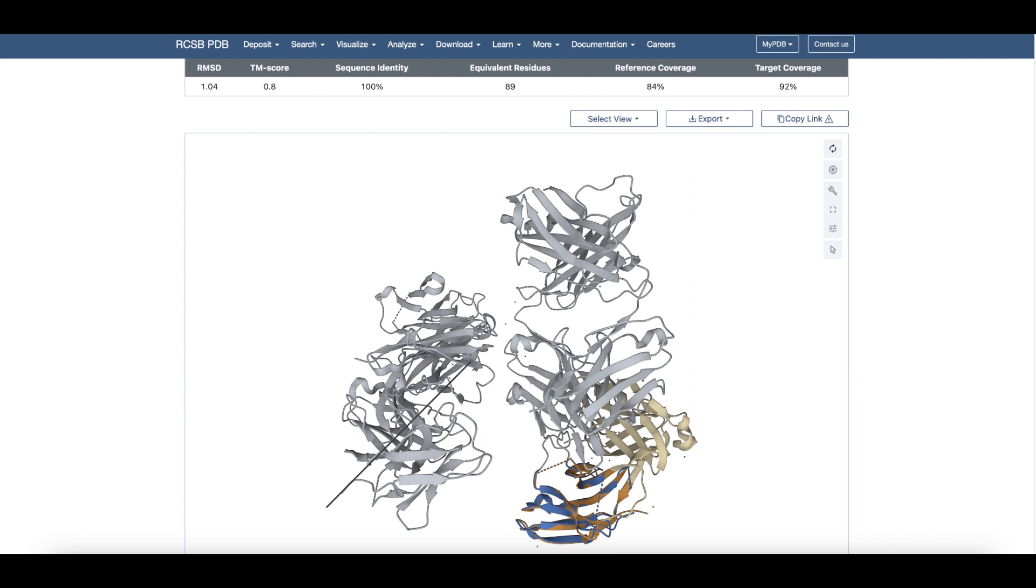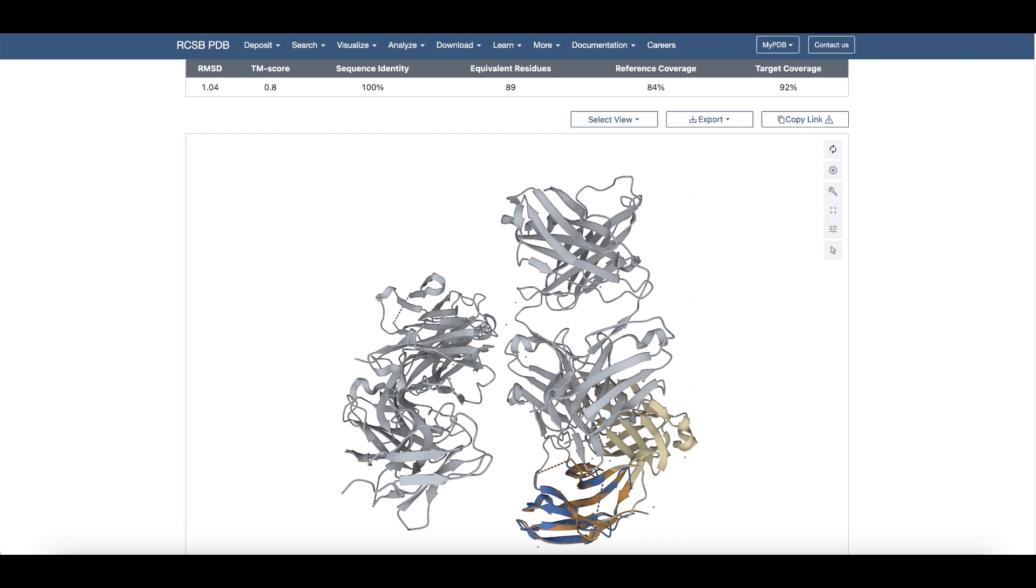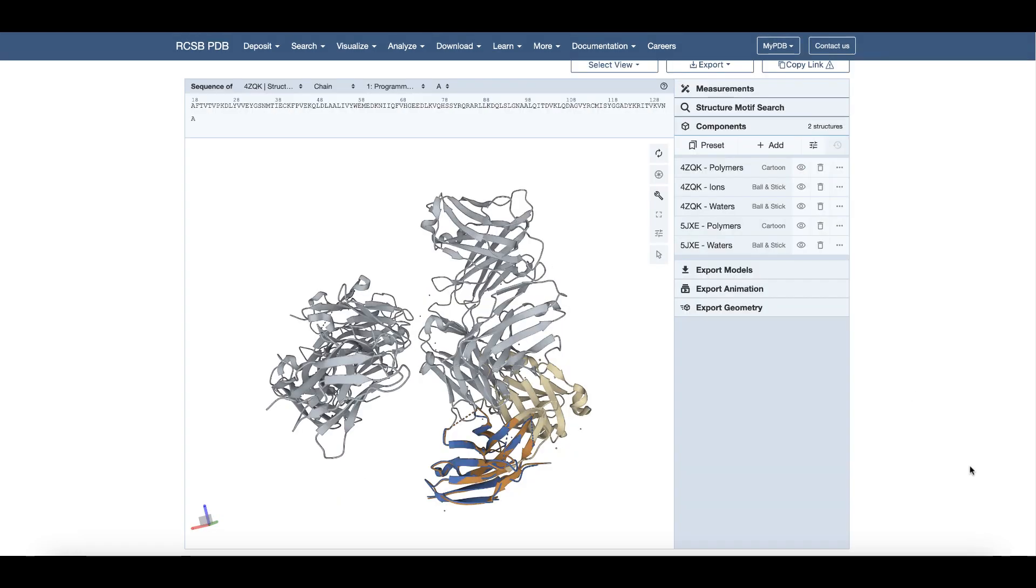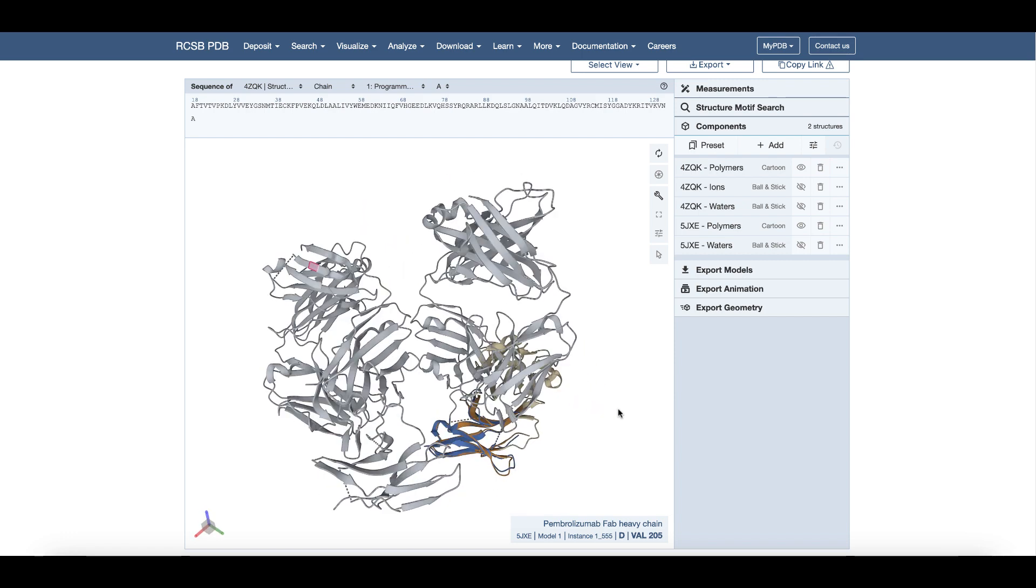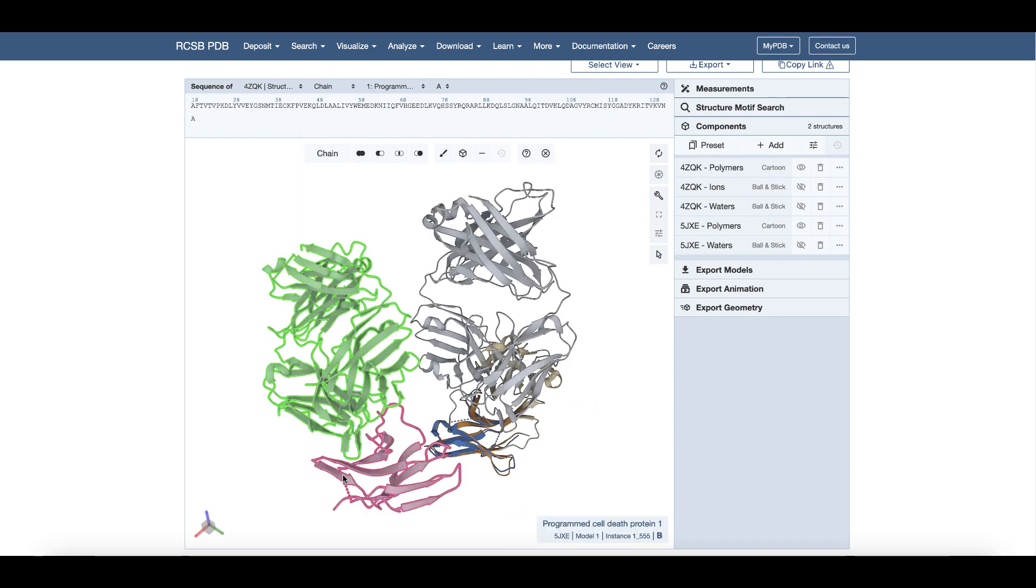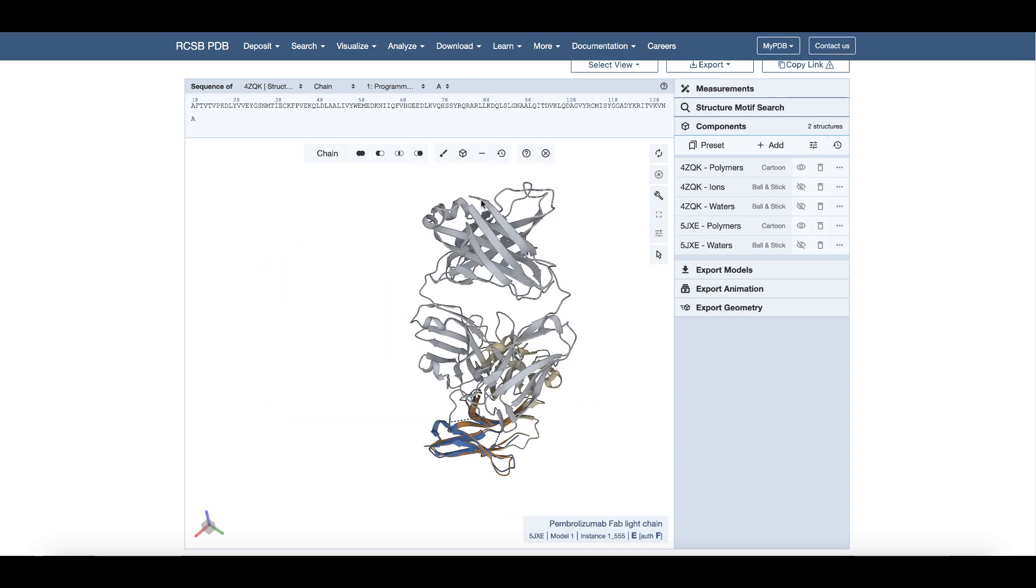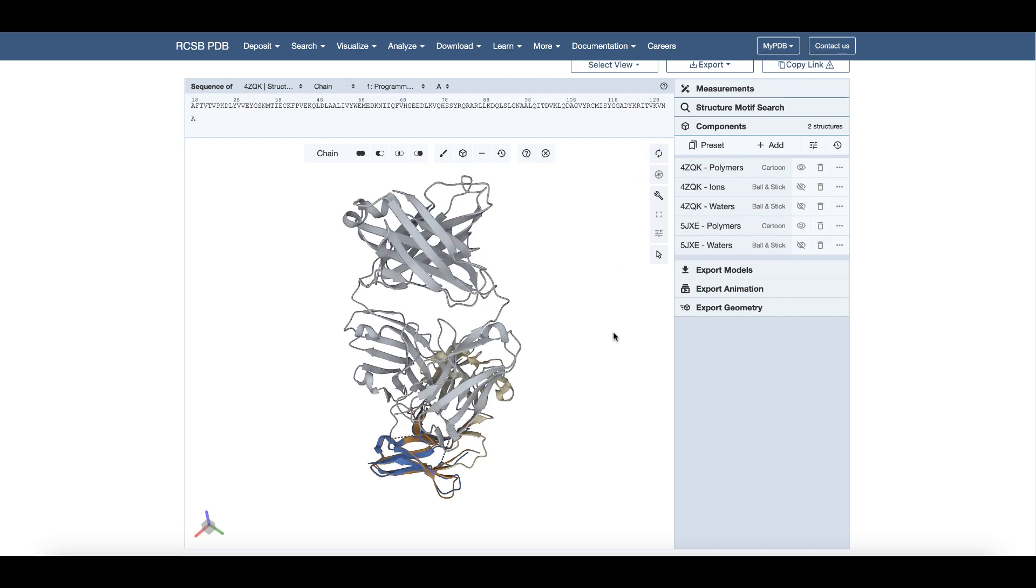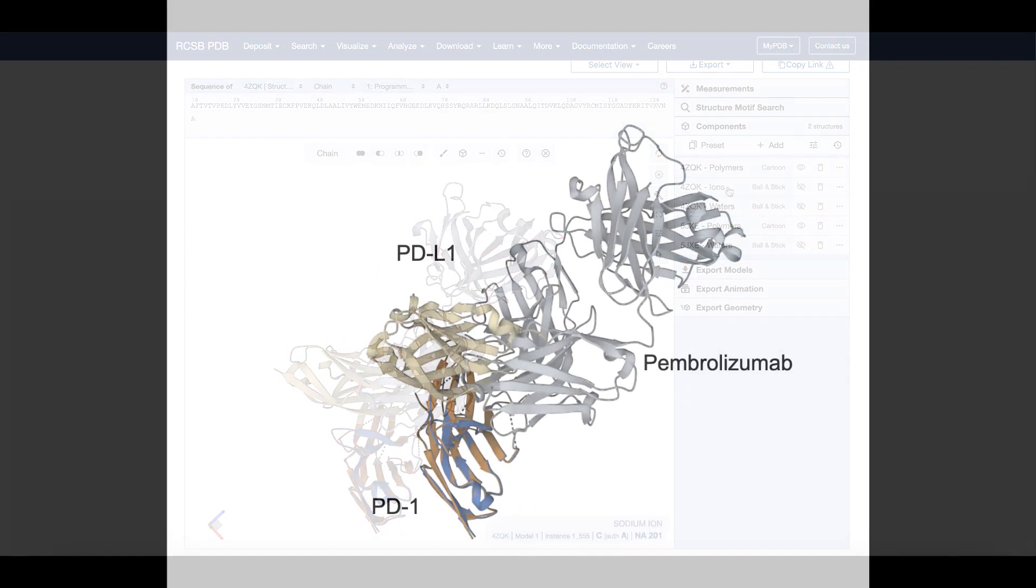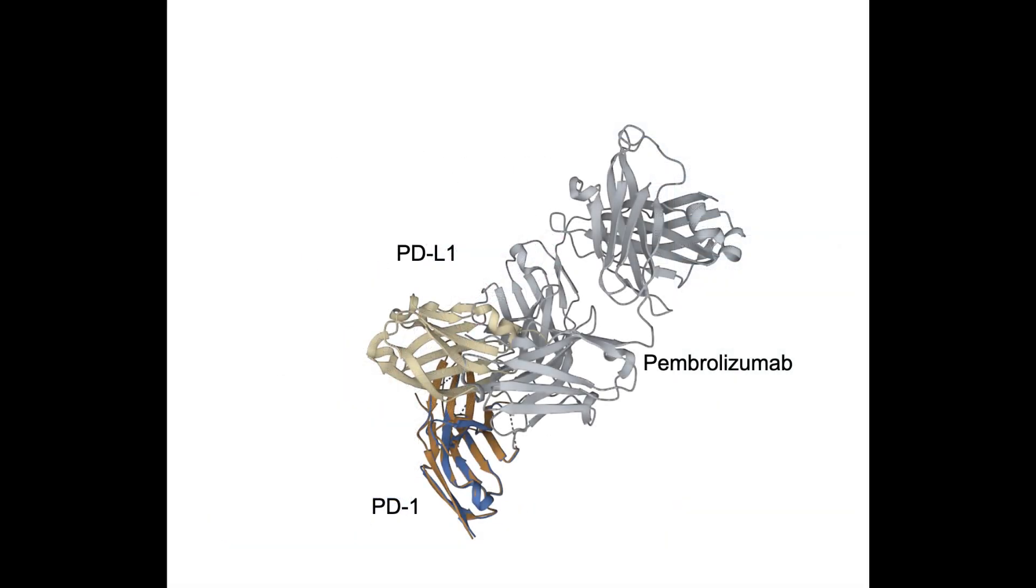We will hide one set of chains for clarity. To do this, open the Molstar options, select the chains distant from the superposed PD-1 chain, and then hide them.